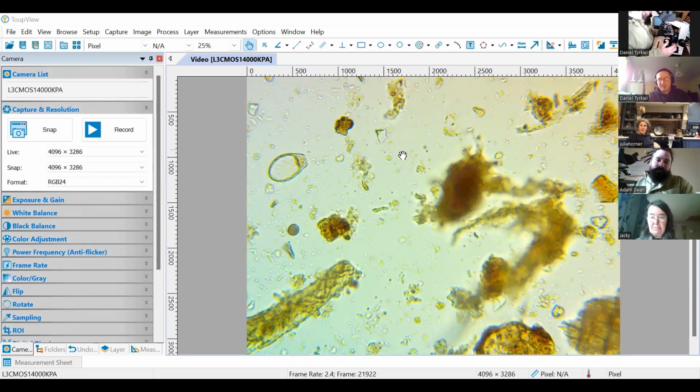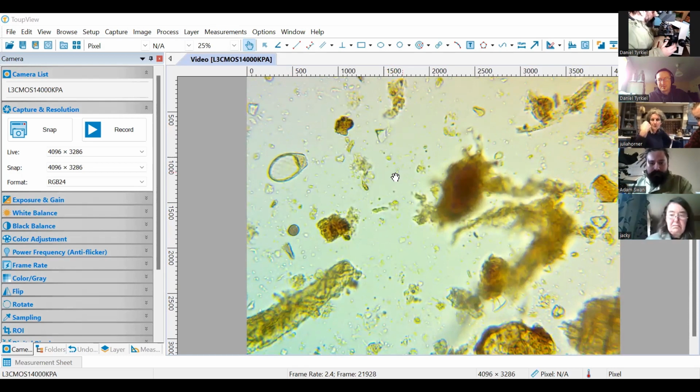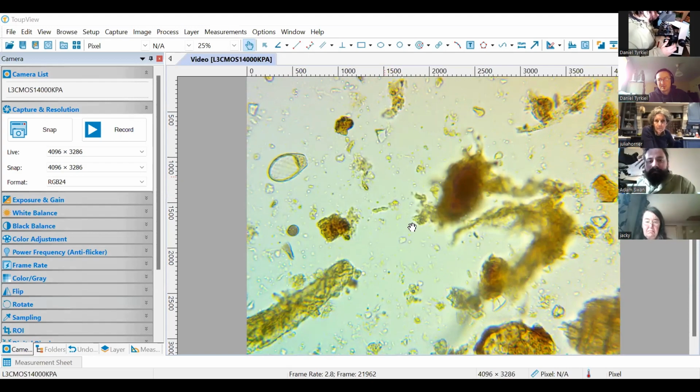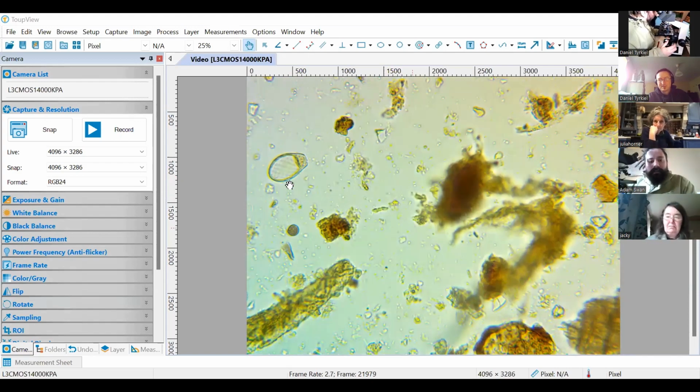You have lots of tiny colloids and bacterial cells. They're just these tiny dots. Some of them look like filaments, some of them rods, commas, spirals, wiggly lines. And then this guy is an example of a protist in the amoeboid group.